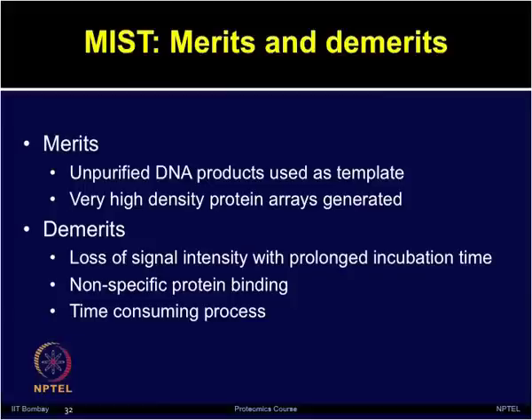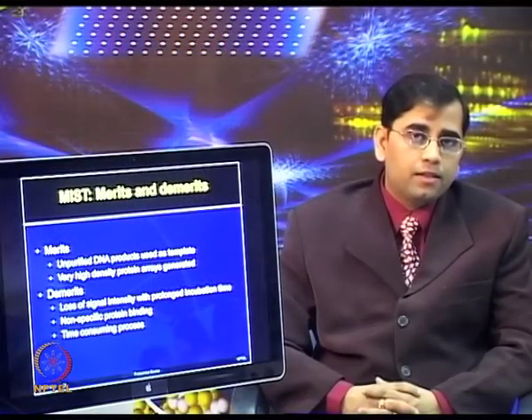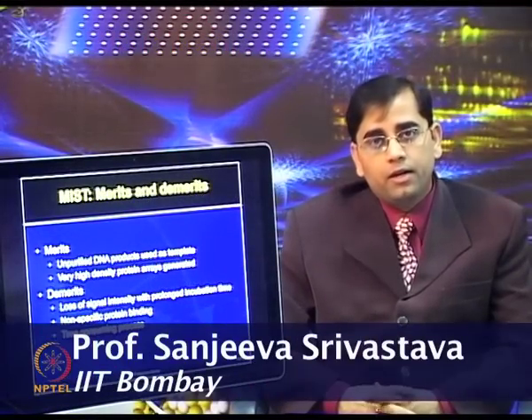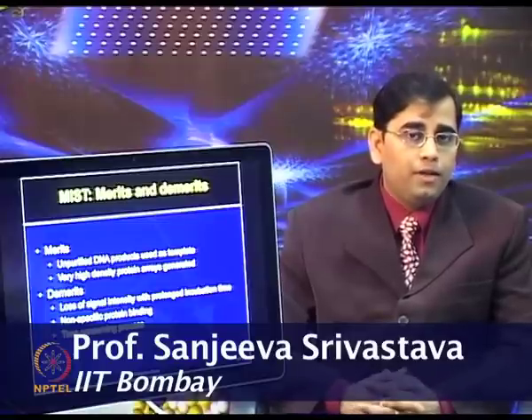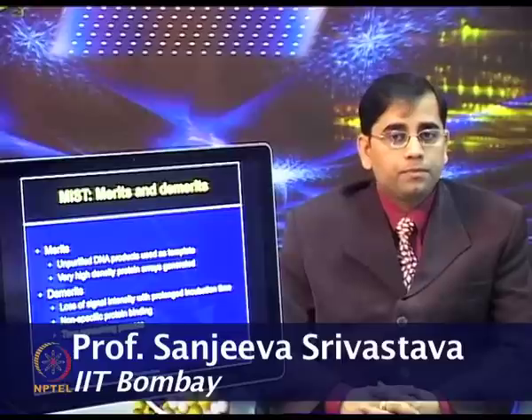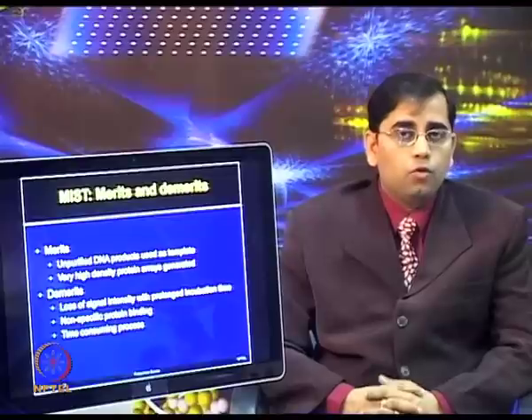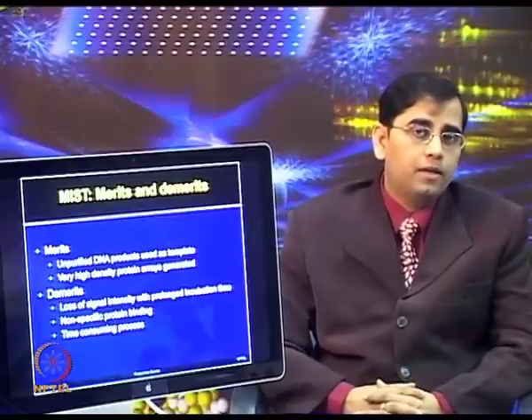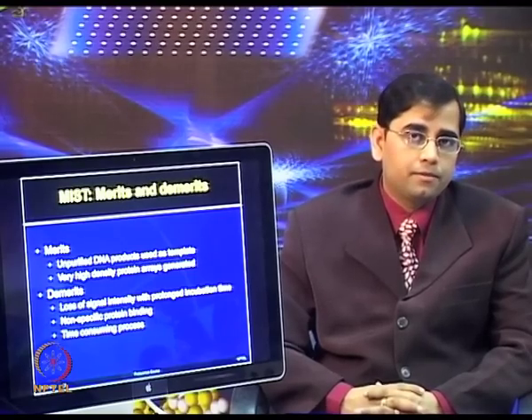The disadvantages or limitations of using the MIST technique are, first of all, loss of signal intensity with prolonged incubation time of the arrays. Since in this case even the cell-free expression systems are printed on top of the arrays, stability could be one of the major issues. There is also non-specific protein binding, and the overall process is more time consuming. These are some of the limitations or demerits of the MIST technique.